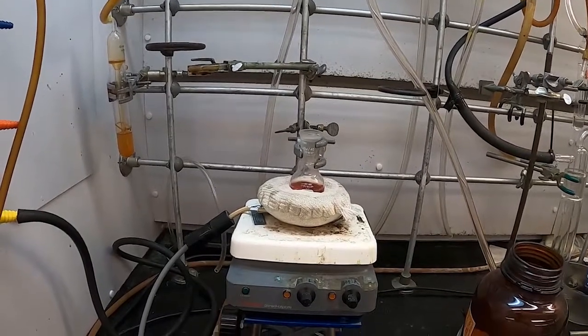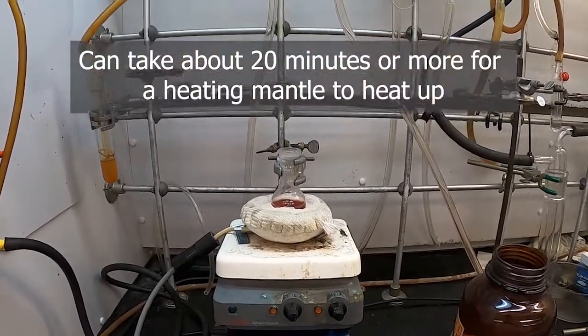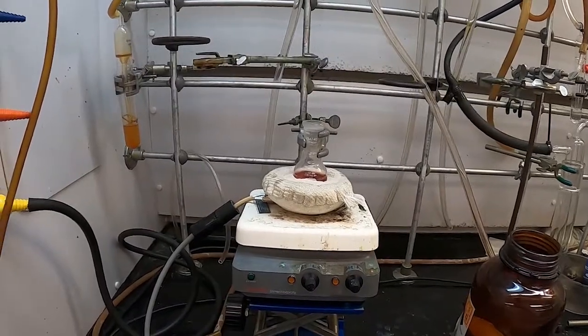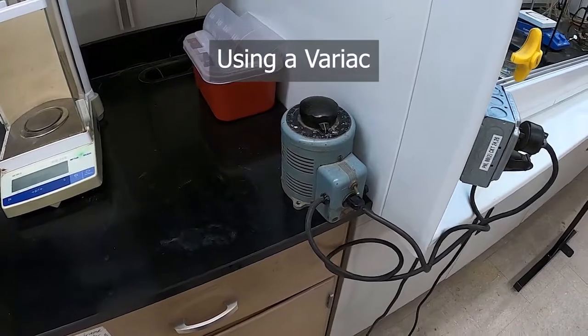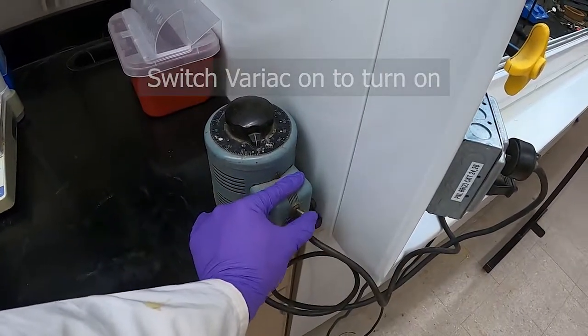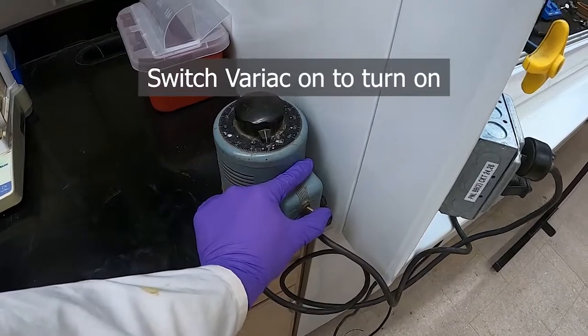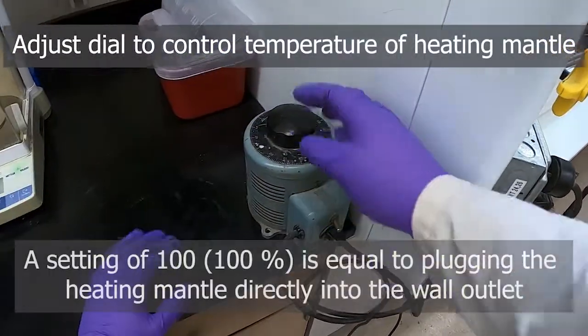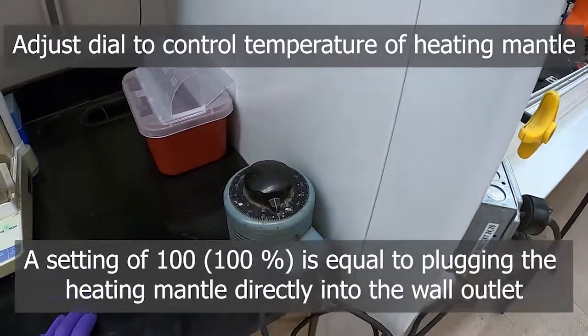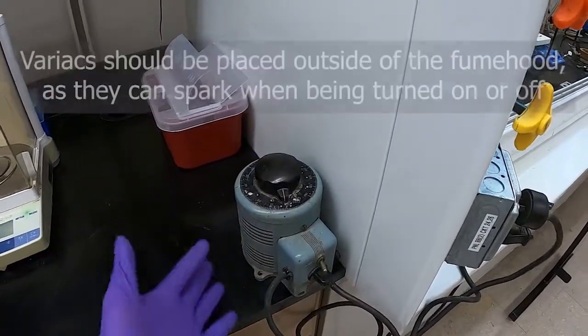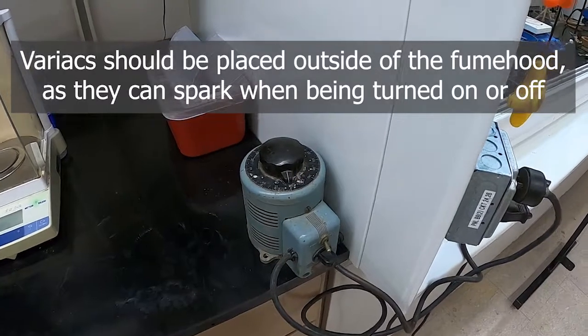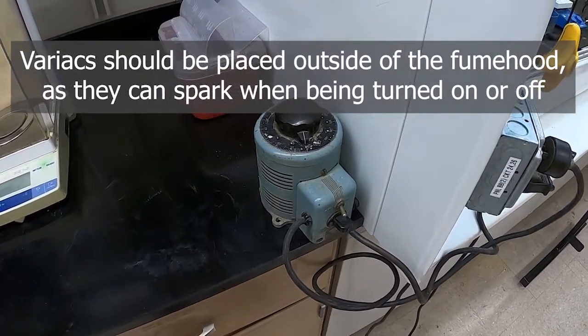Heating mantles heat up pretty slowly. It takes about 20 minutes really before they see much of a change from room temperature sand, so it's something to be aware of if you're planning to use one. A note on variacs: they often have a switch on them to turn them on and off, and then the dial on the top is what determines the power output. I've heard it said that variacs can generate sparks, and in some instances that's a bad idea to be near your experiment, so it's a good idea to have your variac outside of your hood to prevent any accidental ignitions.